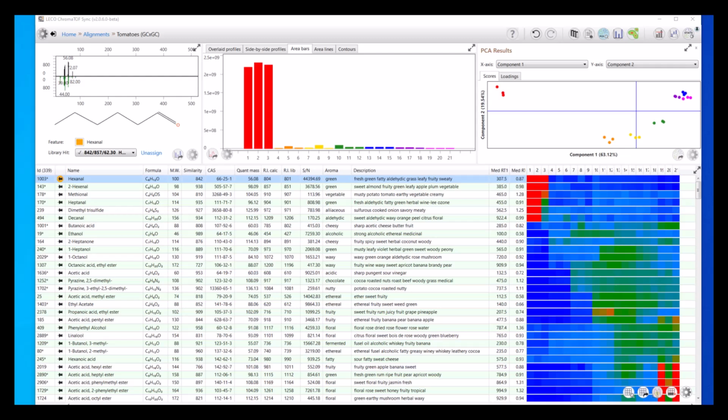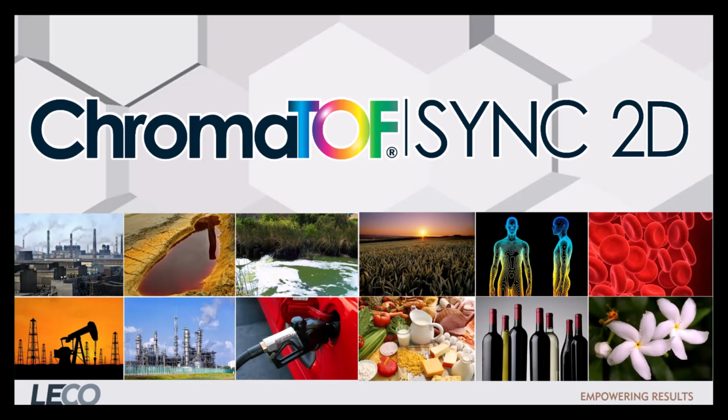After processing, the software takes us directly to the results where we can review individual analytes, perform additional analyses like PCA, and start to understand the similarities, differences, and trends in our dataset. In this example, we explored the chemical changes related to food spoilage, but this tool can help with exploring the chemical changes related to other process types, or it can facilitate the non-targeted characterization of many types of samples and applications for a variety of goals.